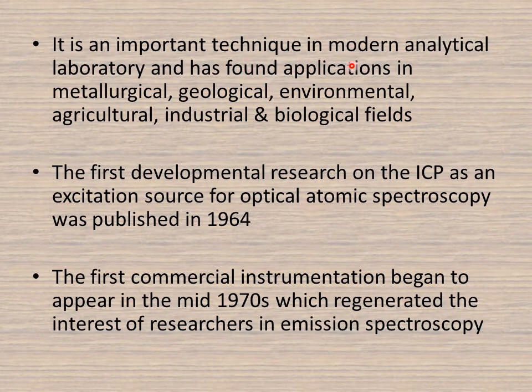It is an important technique in the modern analytical laboratory. The importance of the technique cannot be denied, as it has found a large number of applications in various fields, like metallurgical fields, where we may be interested in qualitative and quantitative analysis of various elements obtained from ores, then geological processes, then environmental samples, in which we might be interested in calculating quantities of various elements, then the agricultural field, industrial field, and biological fields. So it has been widely used in different fields.